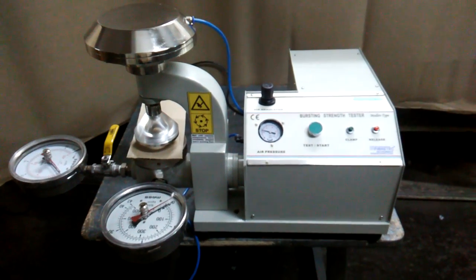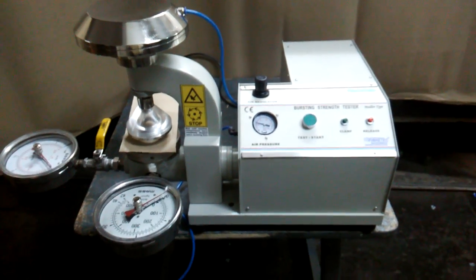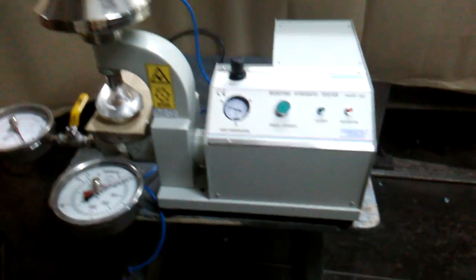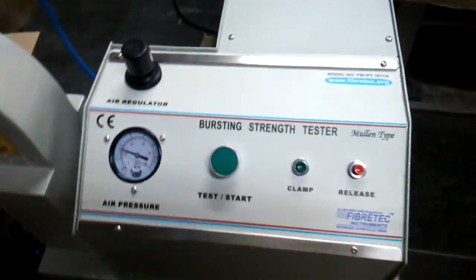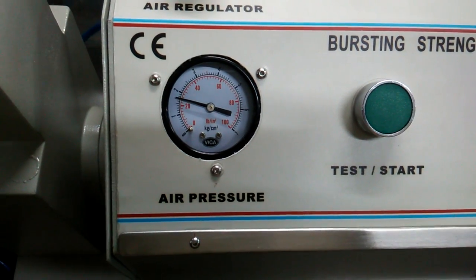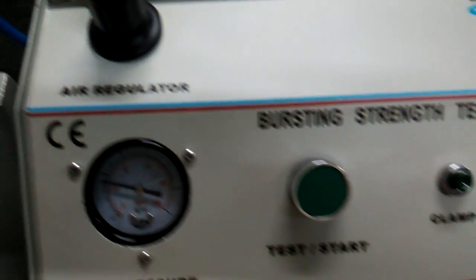Welcome to Fiber Tech Instruments. Today we are going to show you the bursting strength tester for board. Here it is — you can see the panel. This is the air pressure gauge and this is the regulator for it.